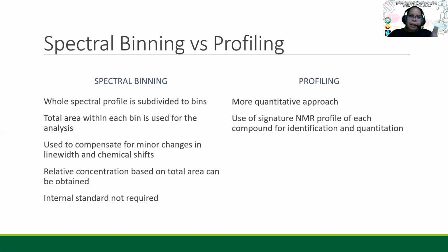But aside from that 5.23 peak, glucose will have a whole cluster of peaks in the 2 to 3 or even 4 ppm region. So they have these characteristic peaks or peak clusters, and these can be used to profile and quantitate your compounds based on the NMR spectra.